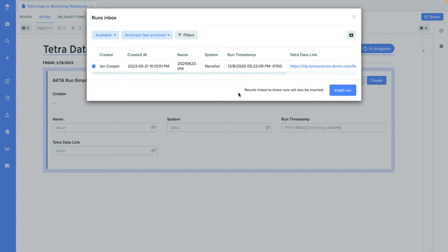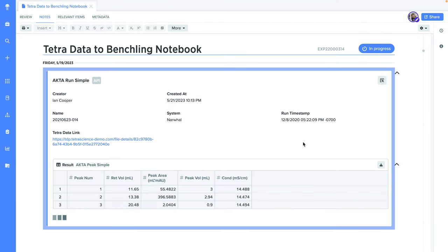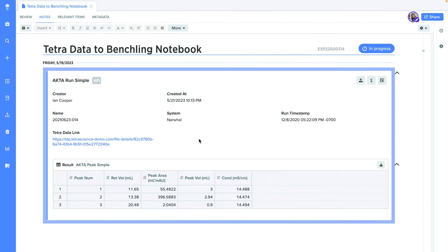Once I insert it, it's moved from the inbox to my notebook entry. Now the run information and the peaks from that Tetra data are available right in my notebook entry, along with the link back to the Tetra data platform for easy access to any raw or Tetra data files.